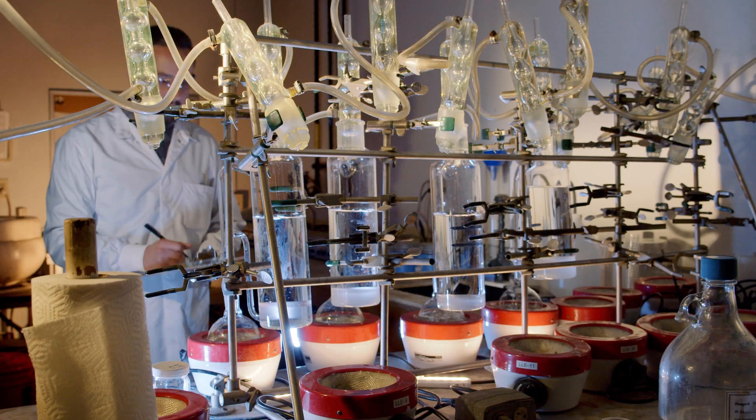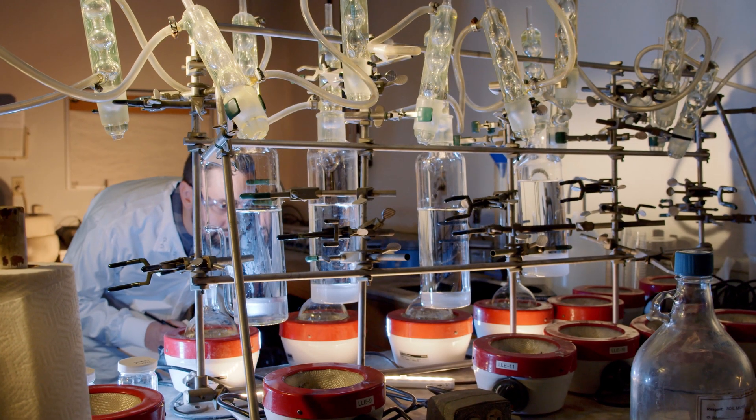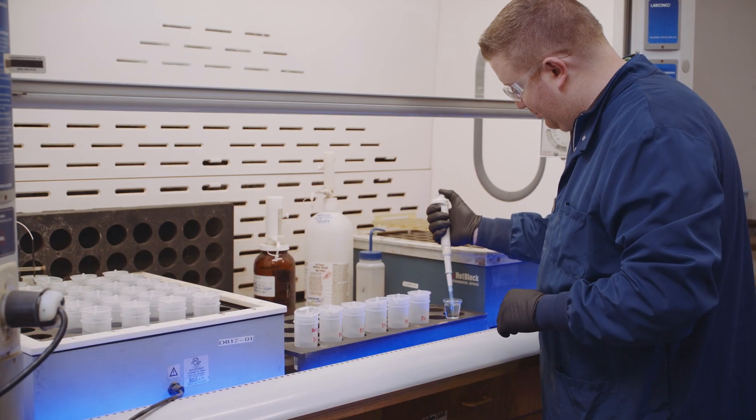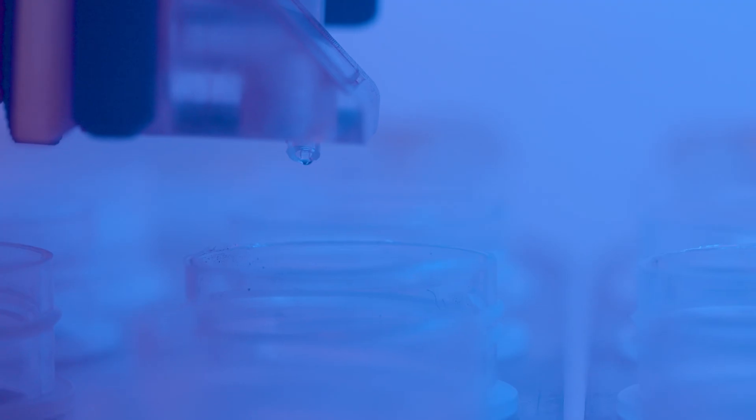Staffed with some of the industry's finest and most experienced chemists, we've been providing high quality analytical reporting for environmental compliance for over 70 years. I've been working with BC Labs for over 30 years. I grew up in the industry with BC Labs.